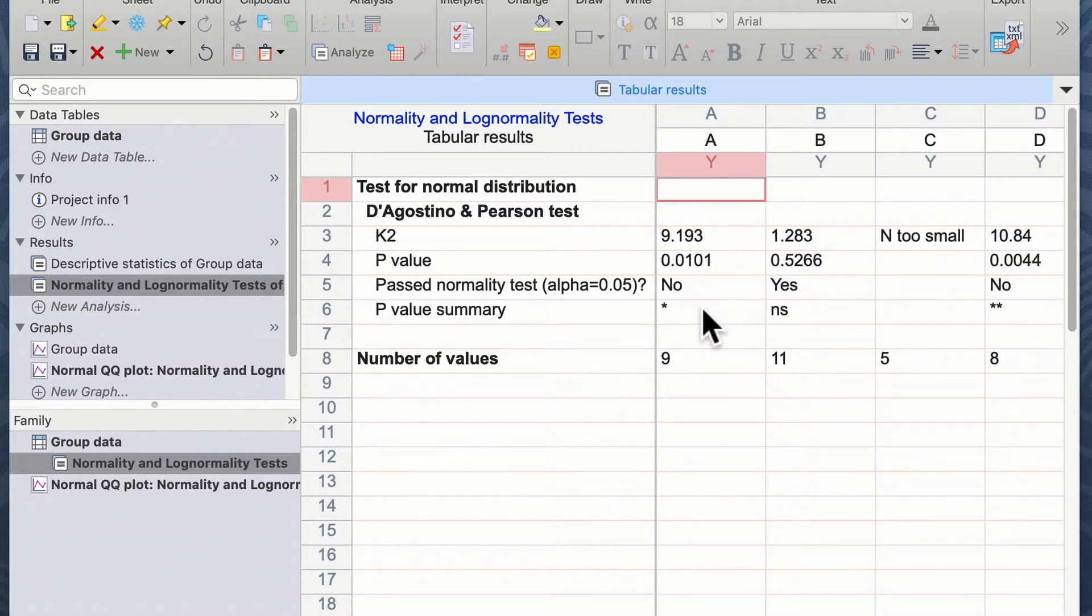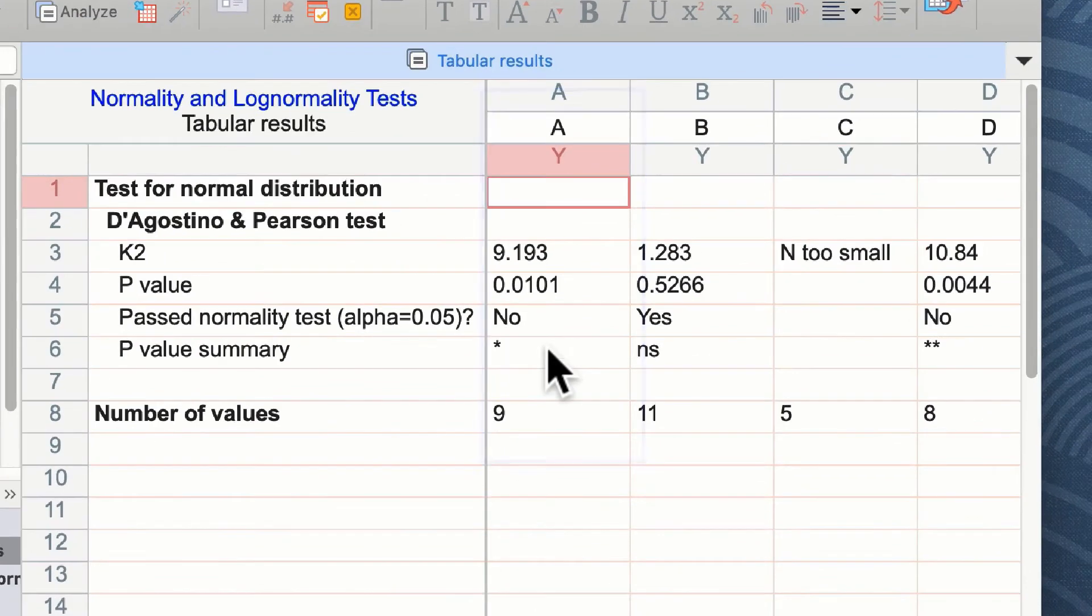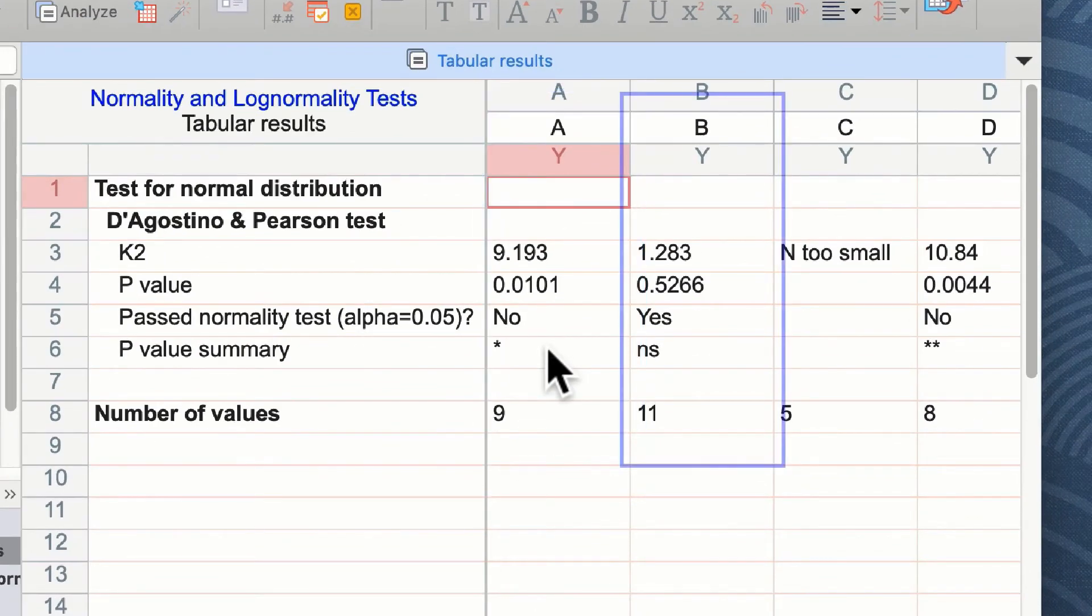It's interesting to see here that group A has failed normality test. You can see that group B has passed a normality test.